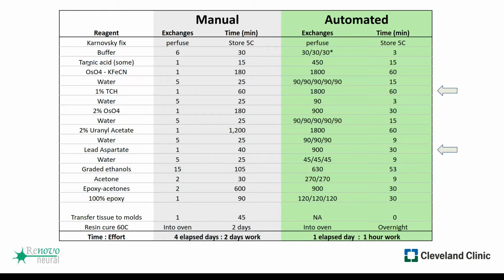So this is great for other approaches too, like if you want to optimize a protocol or optimize something for immuno EM, or you want to have different concentrations of antibodies in different wells, or other experiments in protocol development, where you can do it all in one day instead of having to have a graduate student or a tech working on protocol development that doesn't need to take as long.